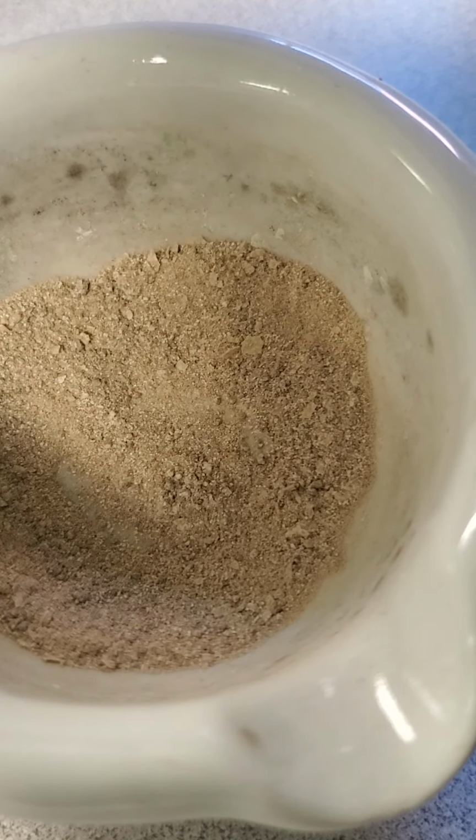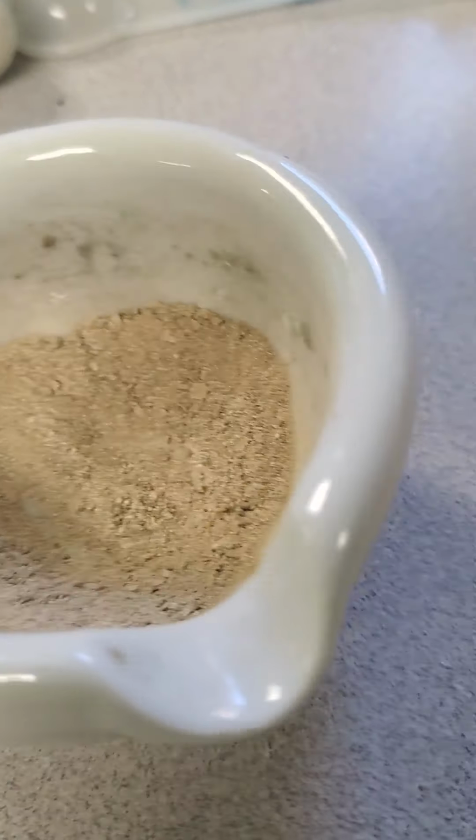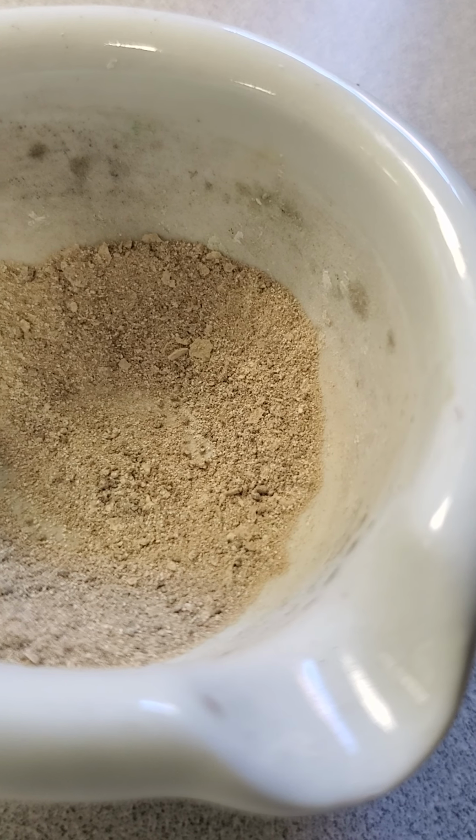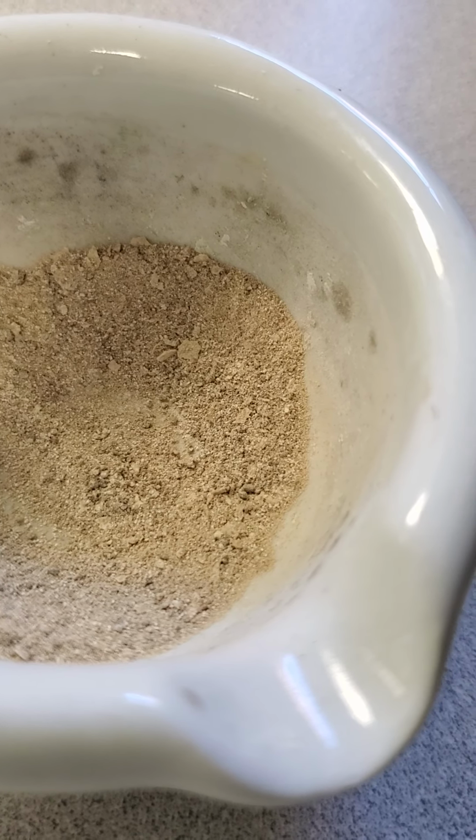So I'm going to put that down for a second. As you can see, it is a tiny powder now. I'm going to put all of the powder in the first cup. So I go over here and I dump my powder into the first cup.